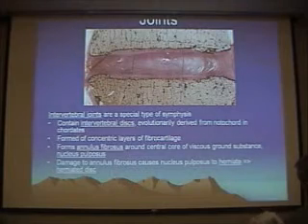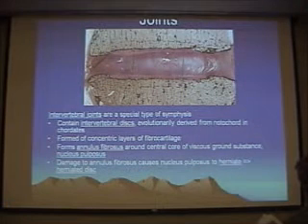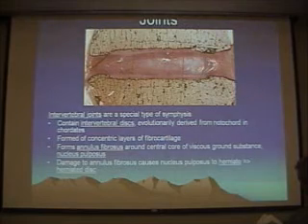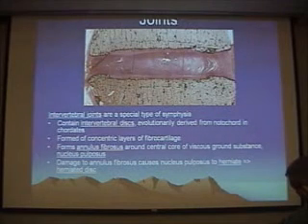Here we have another type of joint, a non-movable joint, a fibrocartilaginous joint, specifically an intervertebral joint. Intervertebral joints are characterized by a softer central region called the nucleus pulposus, surrounded by a more densely fibrous annulus fibrosus.